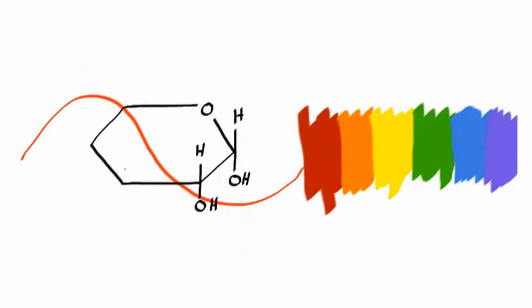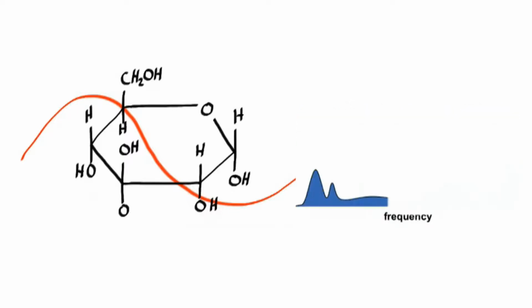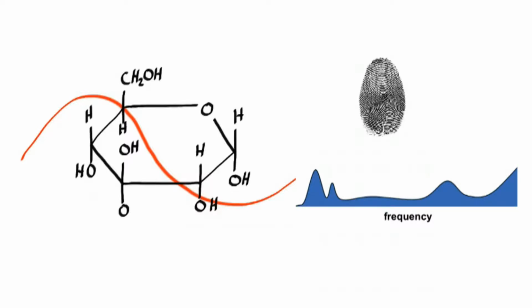it's based. Quantitative infrared spectroscopy allows for a concentration measurement to be made of a specific molecule using infrared light. The wavelengths of infrared light are slightly longer than the visible spectrum, and the energy of these infrared wavelengths corresponds to the vibrational energy in molecular bonds. Every molecule has a unique absorbance depending on the structure of the molecule, just like differently shaped bells produce unique sounds. The absorbance spectrum for each molecule is so unique that it's often referred to as a molecular fingerprint.